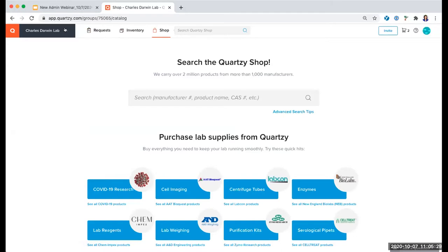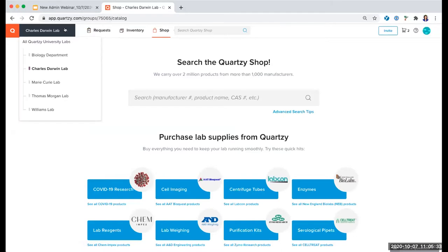There's Requests — your digital shopping list where all items that need to be ordered can be tracked — the Inventory, your lab's list of what you currently have in stock plus where everything is located and any important item data, and the Shop, the easiest way to find and request the items you want to order directly from Quartsy. In the top section you also have the lab selection. Most users may just be in one lab, so that lab name will appear at the top. Other users in multiple labs can easily click on that lab name or the arrow and select another lab, and that lab will stay selected when you move through your modules.